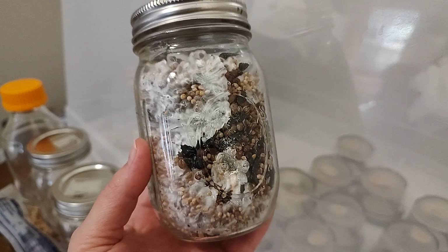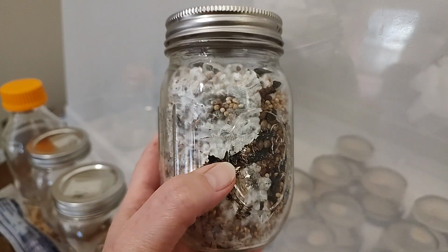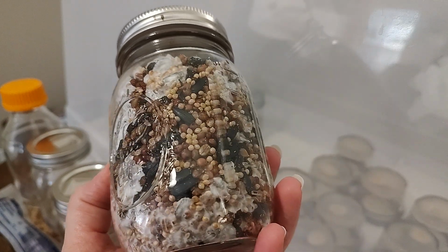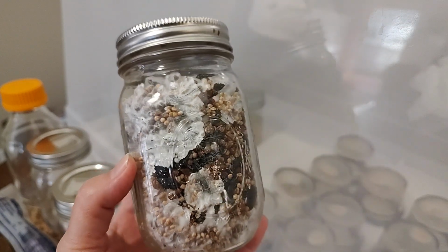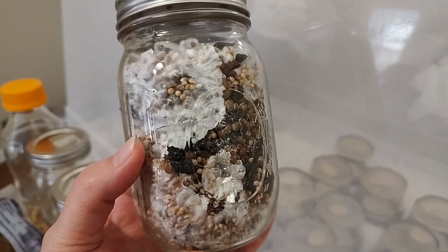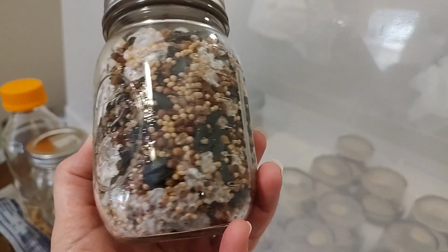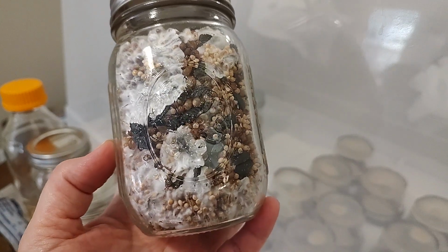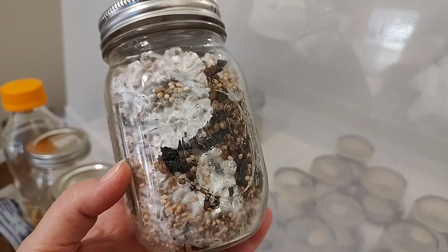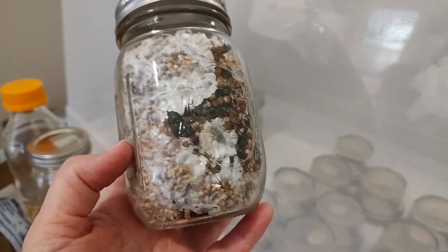When you grow from spore, the spores have to germinate before colonizing. In this bird seed, you can see here, we have tomentose and rhizomorphic mycelium growth around this bird seed, the WBS, the grain jar. So this is colonizing in the grain. This is actually agar, not liquid culture, in this WBS. Because I wanted to show you all the different methods and techniques for you to be able to think through what would work best for you, because you have choices here. There's so many choices, actually. There's not just one way.